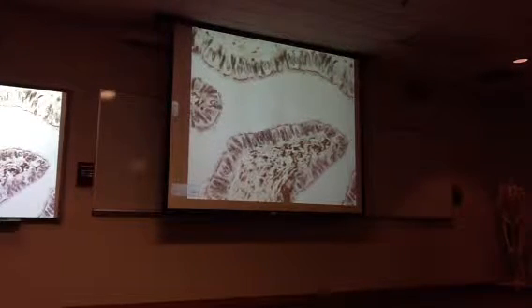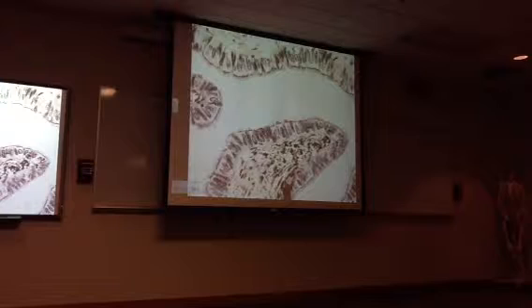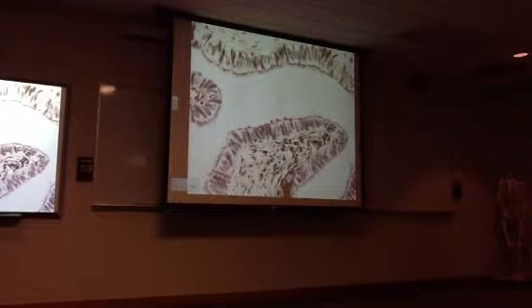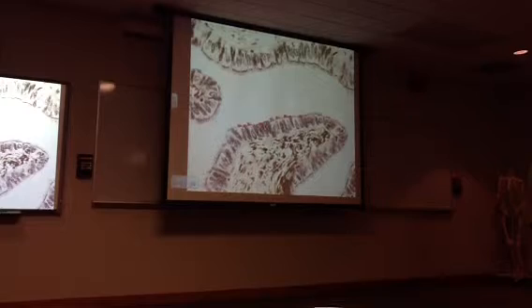Now you may not resolve them right there, but I can see on some of these slides cilia, like that, and I see some slides like that don't have cilia. These are very characteristic of the oviduct, where you have cells that are ciliated and cells that are not ciliated, sometimes right next to each other.